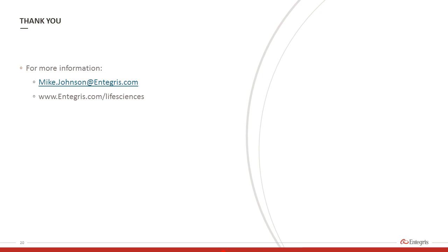And I would say also initially looking at the data shown here in the webinar, I don't see the need right now to add that gas barrier layer to the single layer fluoropolymer material. And then you also have to keep in mind if that were accomplished, then you've got an impact on the extractables profile that would be generated from this material due to the adhesive layer that was placed into the construction.